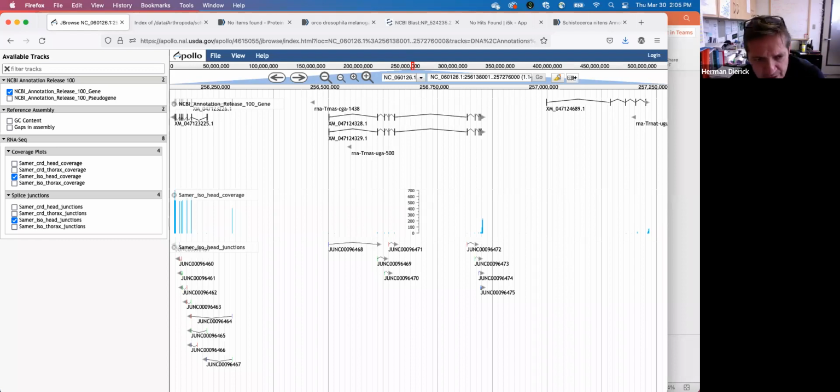I've been using NCBI always for this. Although in flies we use JBrowse a lot, which is the same as the Apollo platform. And I do it with cDNA blasting, which works. But if you use Drosophila, you have to do the very low homology setting, and then it usually picks it up.